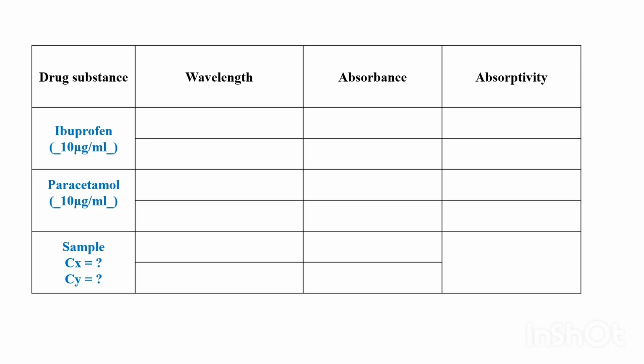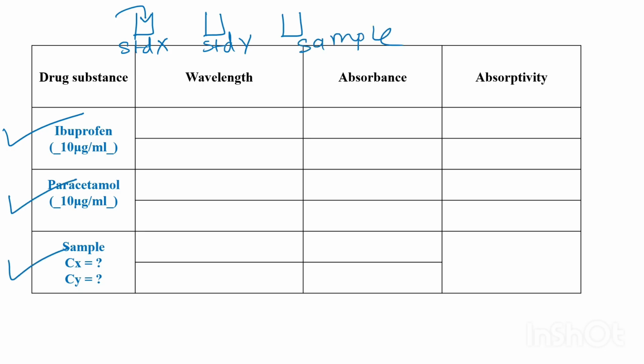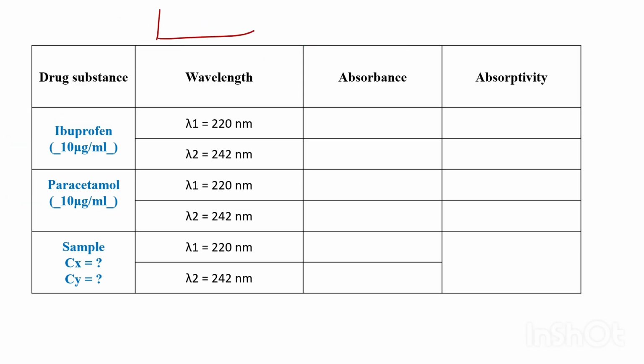Okay, so as I told you, हम लोग 3 फ्लास्क इंस्ट्रूमेंट के पास लेके गए. एक फ्लास्क में स्टैंडर्ड X है, दैट इज ibuprofen 10 ppm. दूसरे में स्टैंडर्ड Y है, दैट इज पैरासिटामोल. और ये सैंपल है. ओके, उसमें का कॉन्सेंट्रेशन वी हैव टू फाइंड आउट. और ये वो फ्लास्क है, हाँ, डाइल्यूटेड वाला. इसमें से 1 to 10 एंड 1 to 10. ओके, सो ये वाला फ्लास्क है सबका, तीनों का डाइल्यूटेड. सो 220 जो आया ना हमें, वो 220 हमें आया ये आइब्यूप्रोफेन का. ये देखो आइब्यूप्रोफेन का ऐसा पीक आया था, ठीक है. और पैरासिटामोल का यहाँ पे ऐसा कुछ पीक आया था. So this is 220 and 242 nanometers.